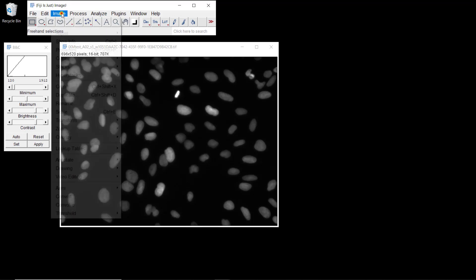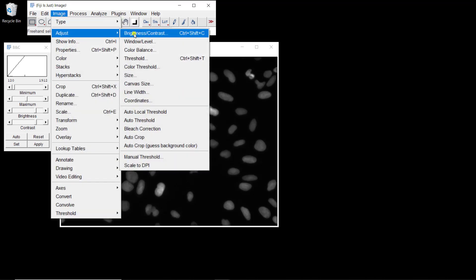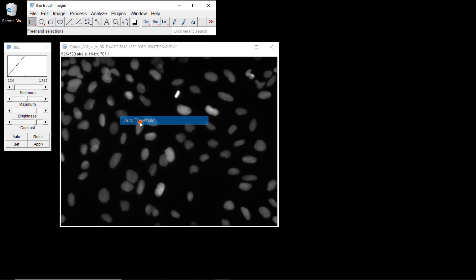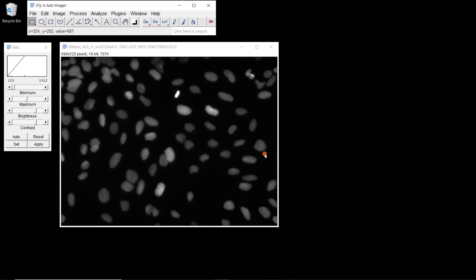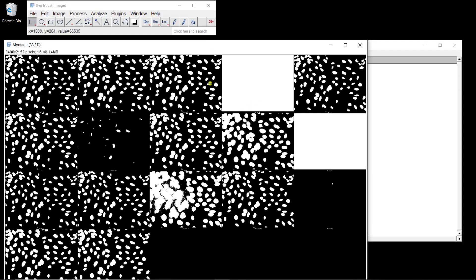Now we can try it. If we go to Image > Adjust > Auto Threshold, we can try all the thresholding methods that are included with Fiji. And now you can see the results.